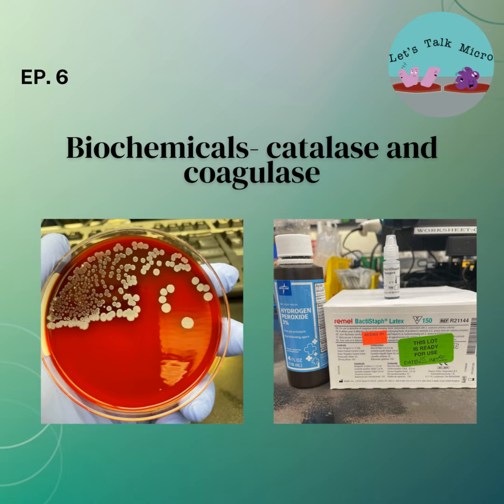It is an enzyme that catalyzes the release of water and oxygen from hydrogen peroxide. How do we perform this? Well, very simple. We add a drop of hydrogen peroxide to a slide, and then we apply a colony to that drop. Alternatively, you can add the colonies to the slide and then add the drop of the hydrogen peroxide. I mentioned that you can use it for gram-positive cocci and gram-positive rods.